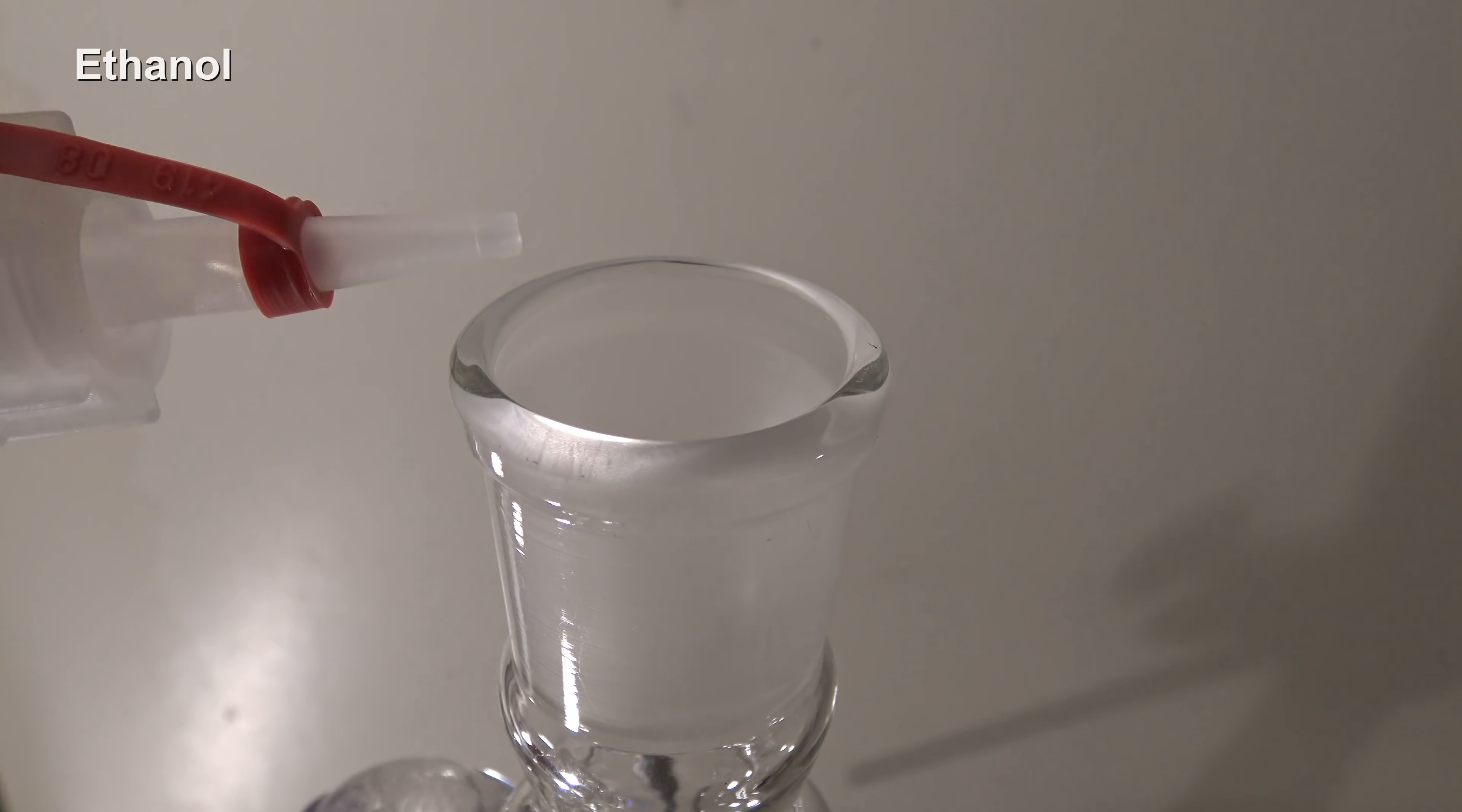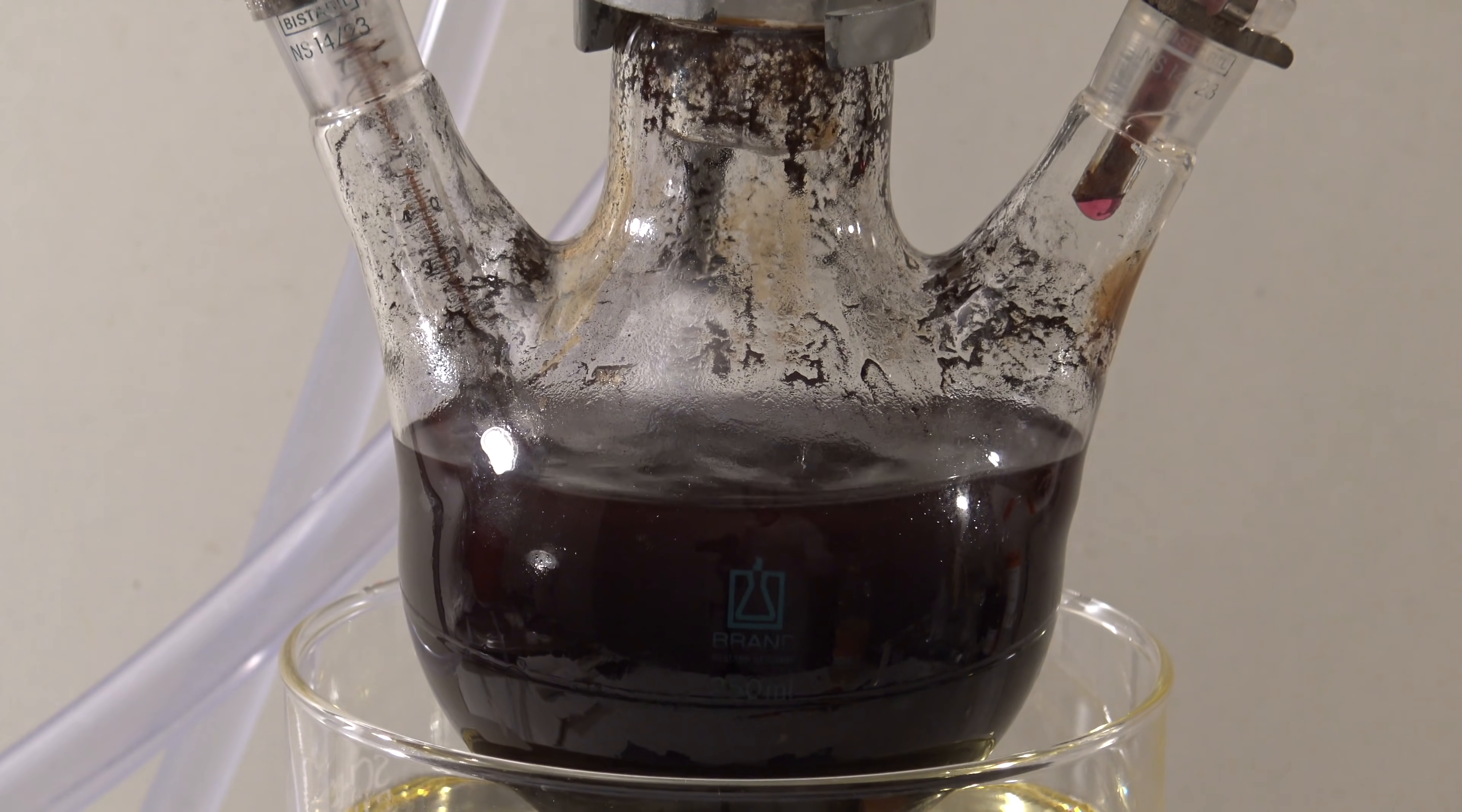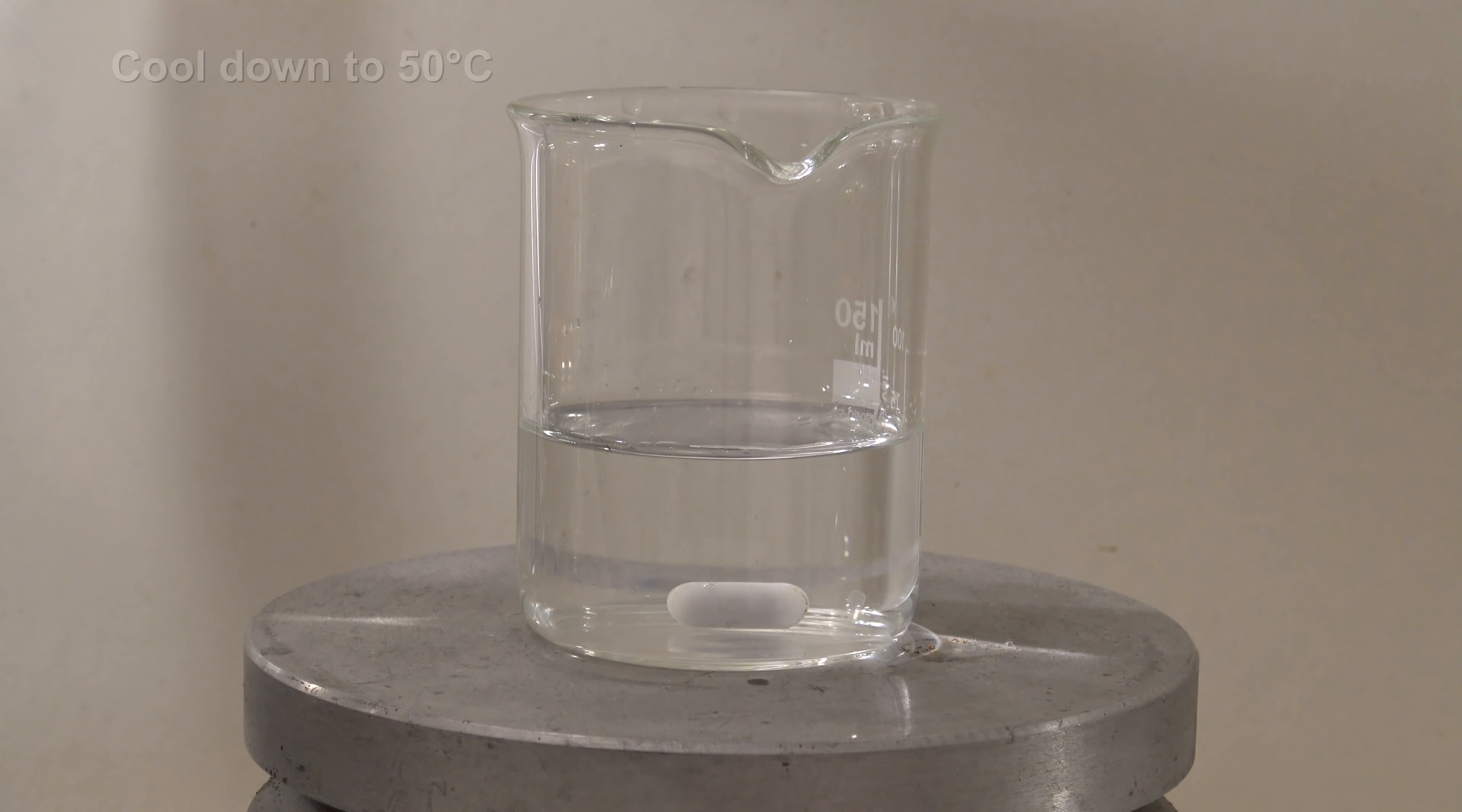At the end, some ethanol was added and the mixture was stirred again to reduce the residual permanganate, then it was left to sit until it reached 50 degrees Celsius.